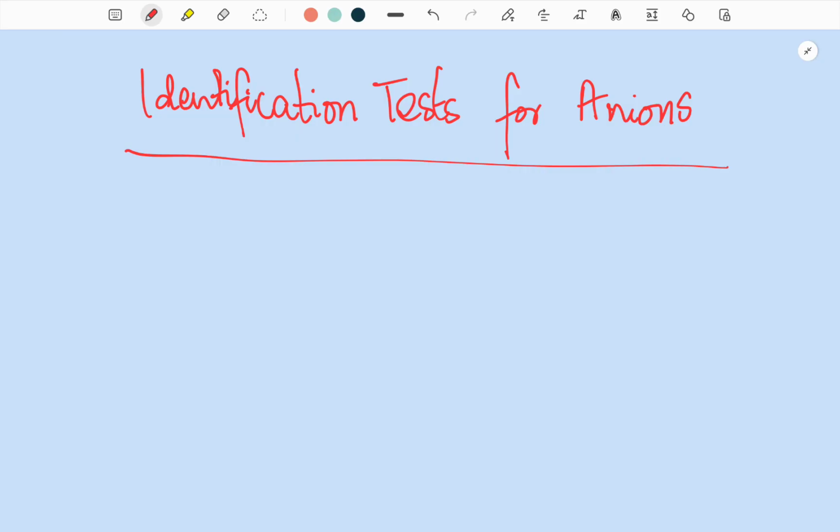Okay, so when you're performing a reaction, you are getting a vinegar smell. In your record or in your exam, you are going to write a vinegar smell is observed. But what is causing that vinegar smell? That is known as the chemistry. What is the product formed? What product is actually giving off that vinegar odor? That is going to be known as your chemistry, and that you don't need to mention in your exam, but you need to have a general idea of it, because in your Viva, the examiner is bound to ask that.